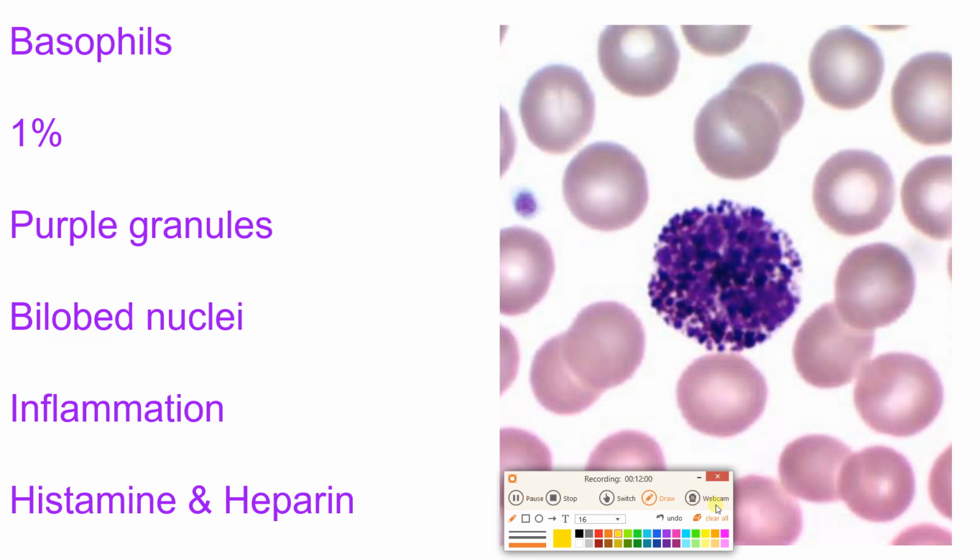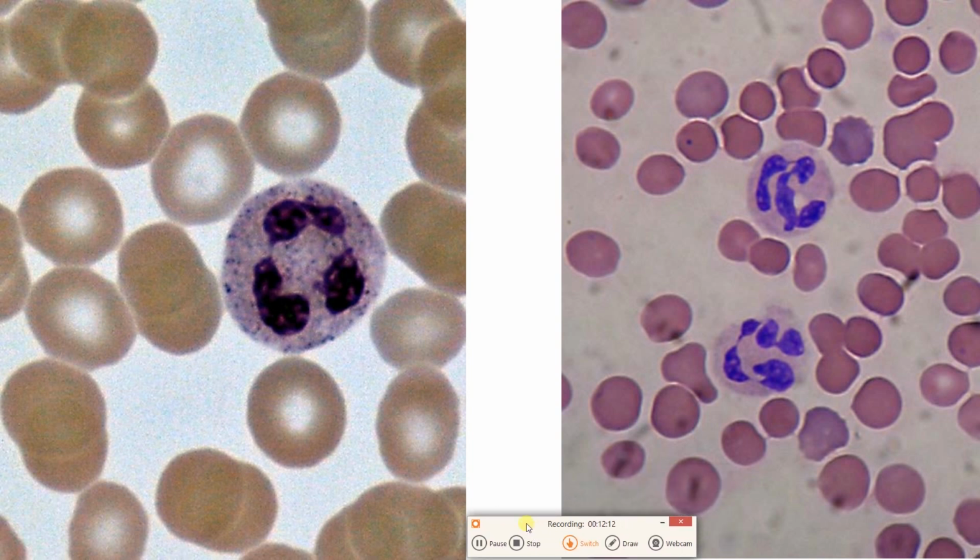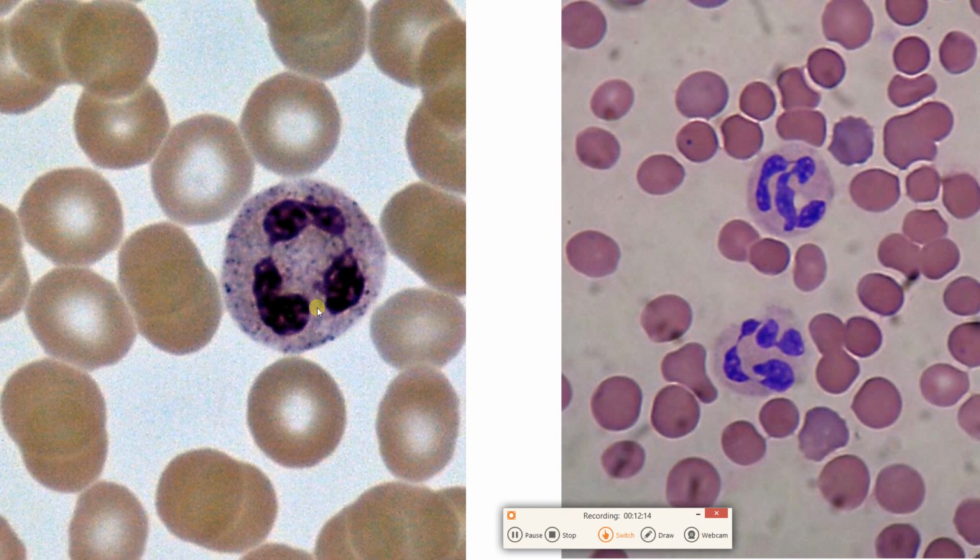All right, fantastic. Hopefully you guys are following along with me. I've got a bunch of red blood cells here, and I have one variety of white blood cell. Can you figure out what I got? This dude, this guy, all the same thing. Give you a second, and it is a neutrophil. These guys are neutrophils. Did you get that right?